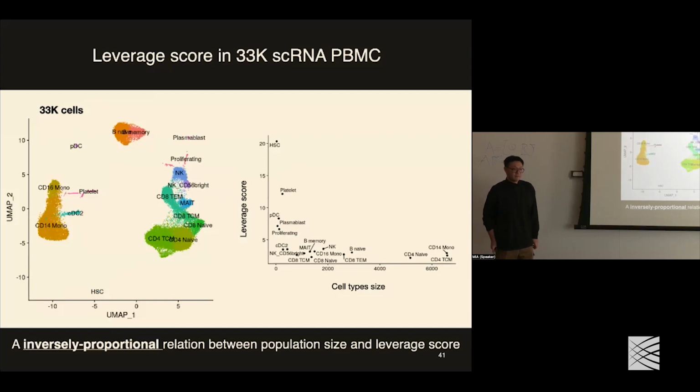My question is about one way that you could do the sketching, which is by doing some density estimate and then downsampling based on density. Yes, inverse of the density. But here you're using the leverage score, and you're saying it's kind of similar, like the very low density cell types have a high score. Yes, so somehow these seem related.